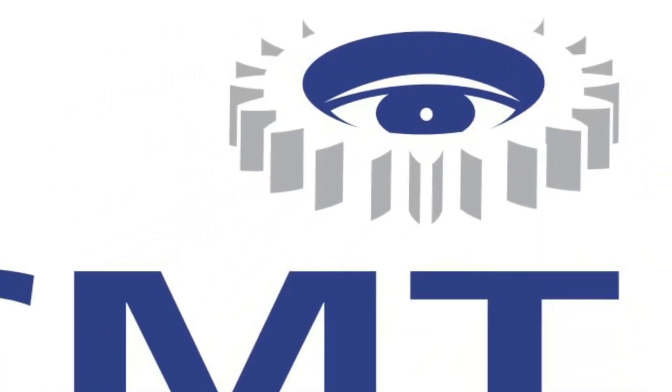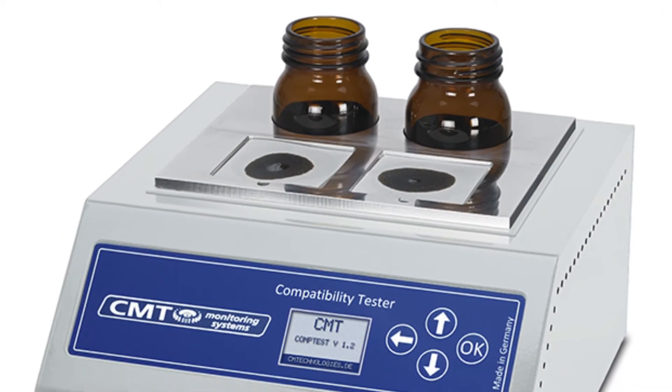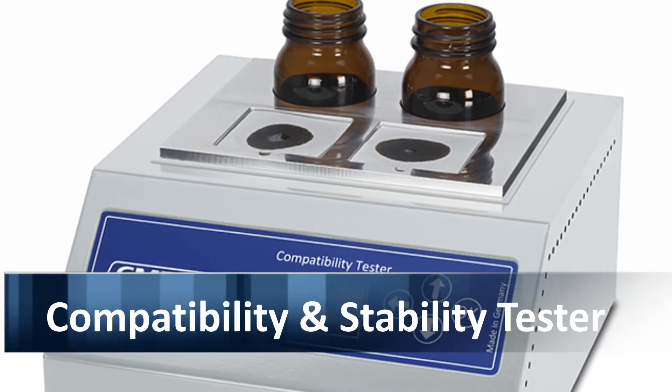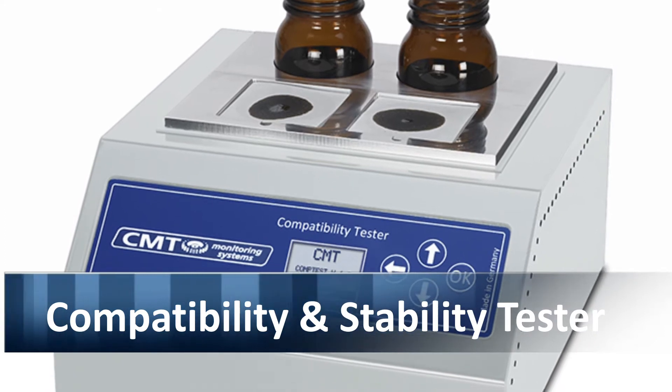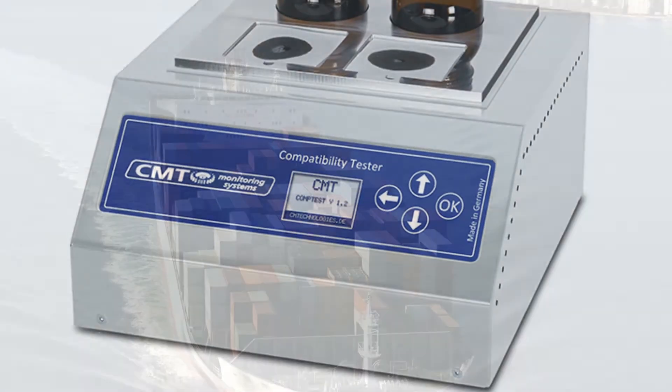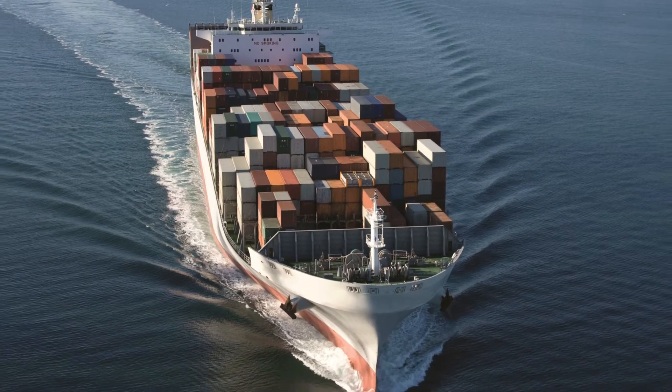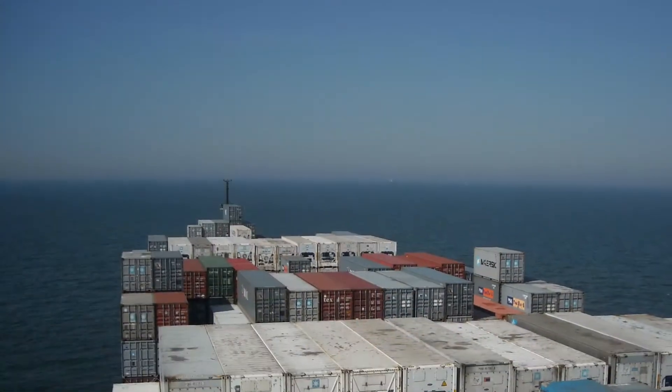This video describes the usage of CMT's electronic compatibility and stability tester. The changes which have come with the Sulfur Cap from the 1st of January 2020 make testing the compatibility and stability of fuels more relevant than ever.